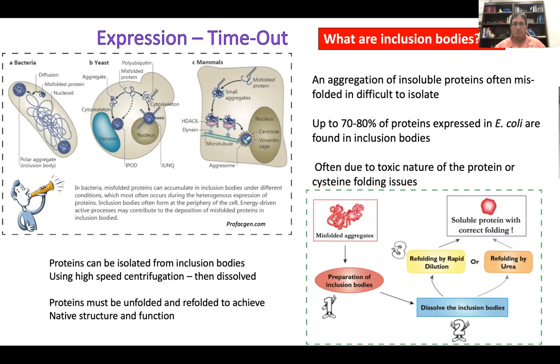All right, so if you get too much protein, some of your protein goes in there, in fact, even in a good expression system. We talked about watermelon and human MDH1 being good expressors. You look for the inclusion bodies, you'll still see a whole bunch of protein there, and they do not lyse with cells. They're very difficult to lyse.